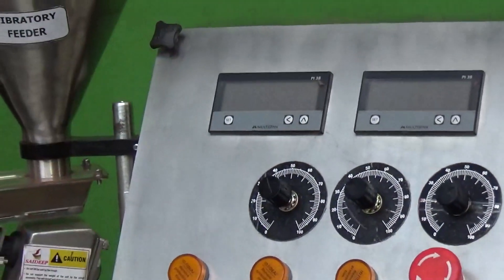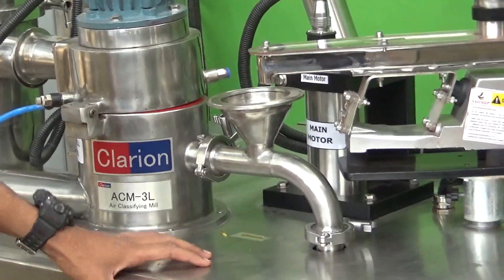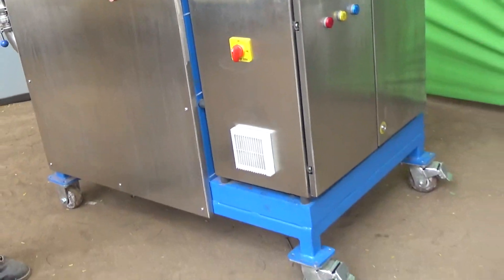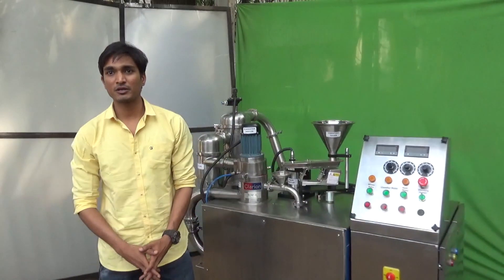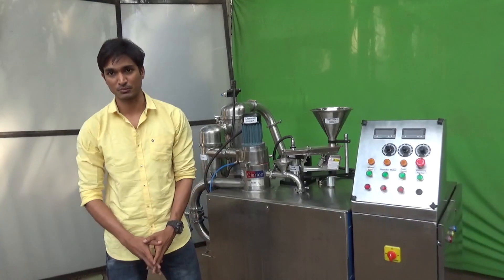This entire machine is a lab model and also a portable machine. We can move this machine anywhere very easily. Wheels are mounted at the underside of the machine to help move it from one place to another. We make machines from one horsepower lab model to 600 horsepower production machines.